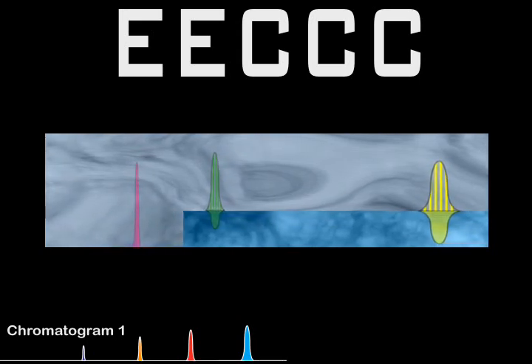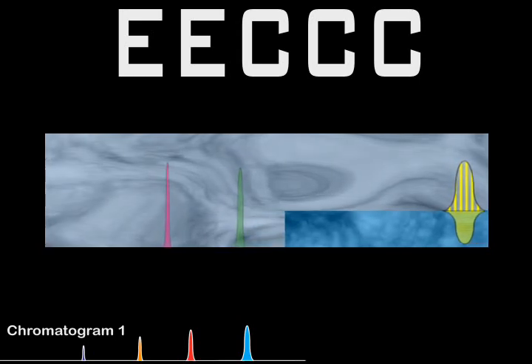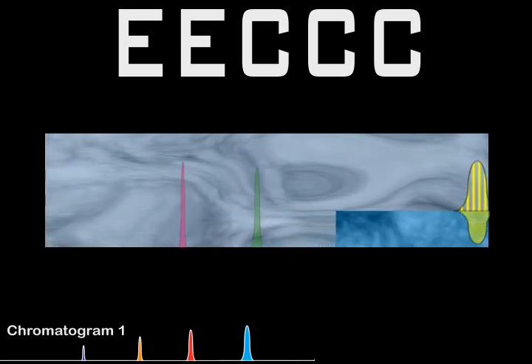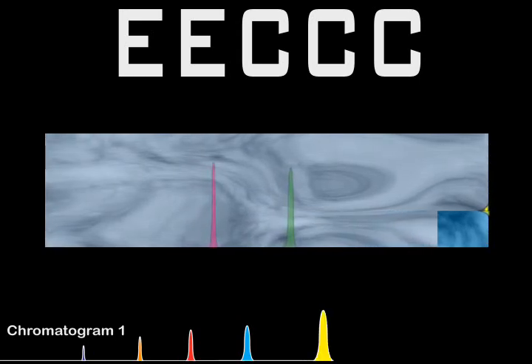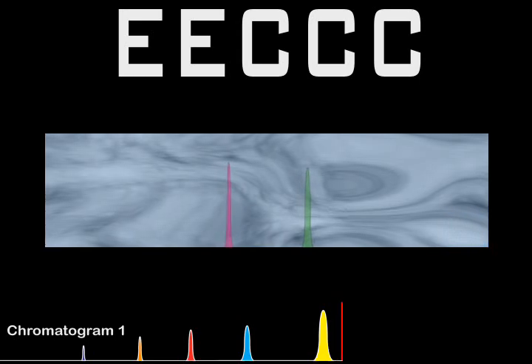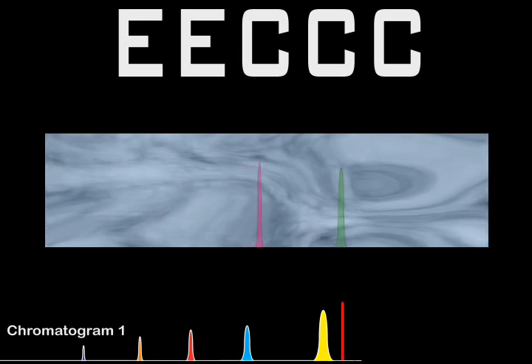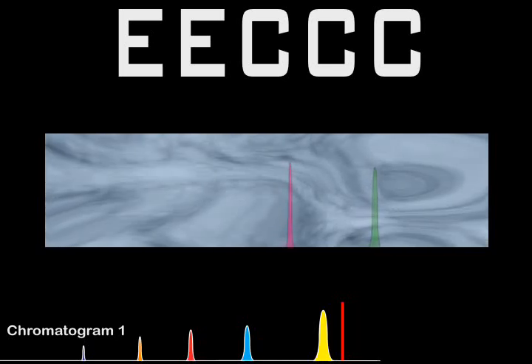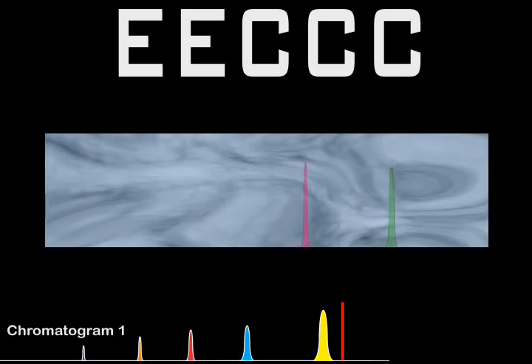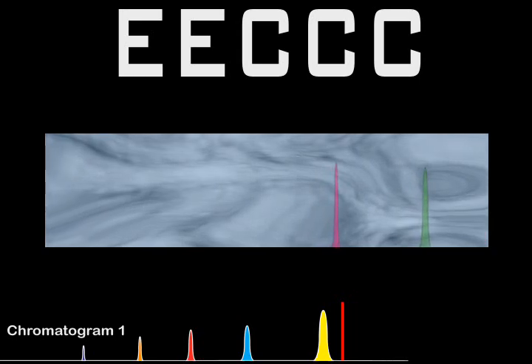This new mobile phase pushes the old out of the system, and for a short time elution still continues on the compounds that are in contact with both phases, such as the yellow we see here. The pink and green compounds are now traveling with the new mobile phase, and will be extruded from the column much faster than if we would have simply continued the classical elution process. Also, they will experience only a fraction of the broadening of a normal run.